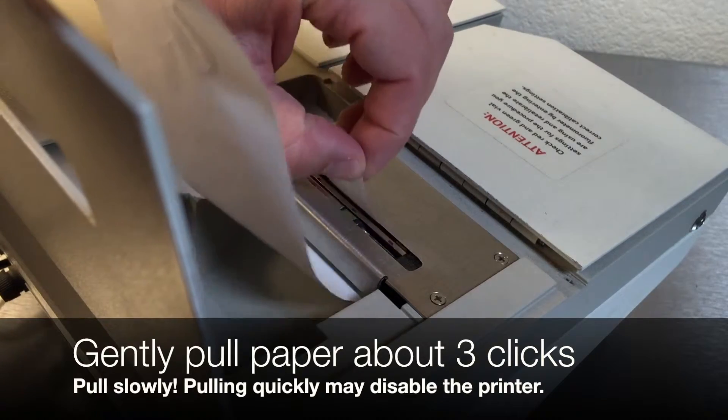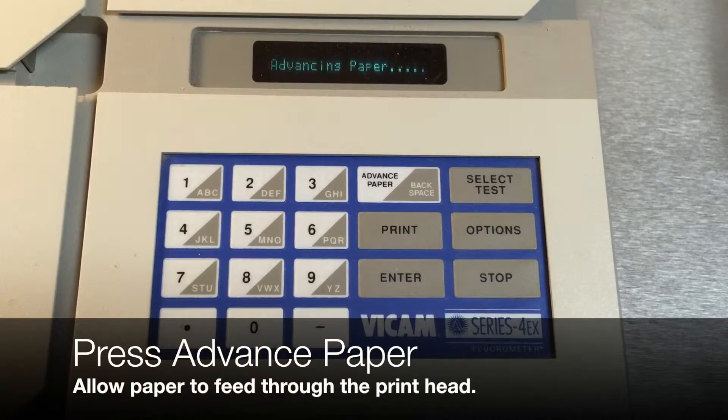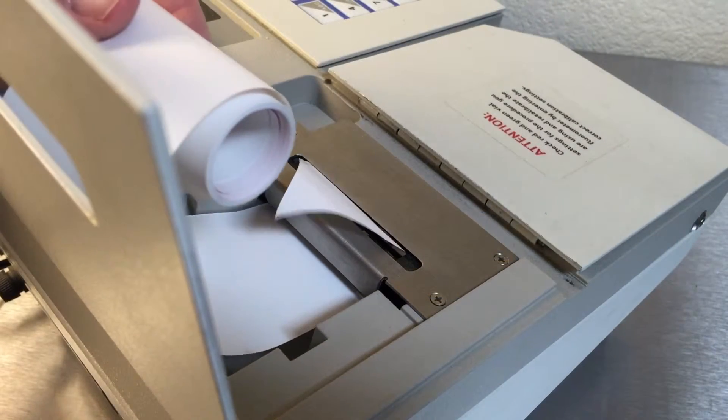Then gently pull the paper about three clicks. Press the advance paper button. The paper will pull into the printer.